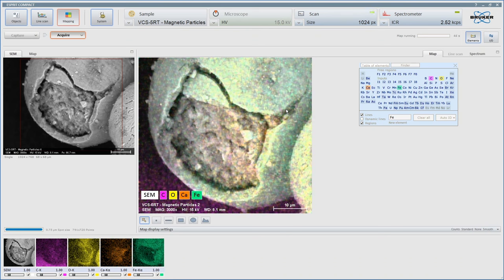Wow. Are you seeing what I'm seeing? Calcium here on the inside. Calcium.